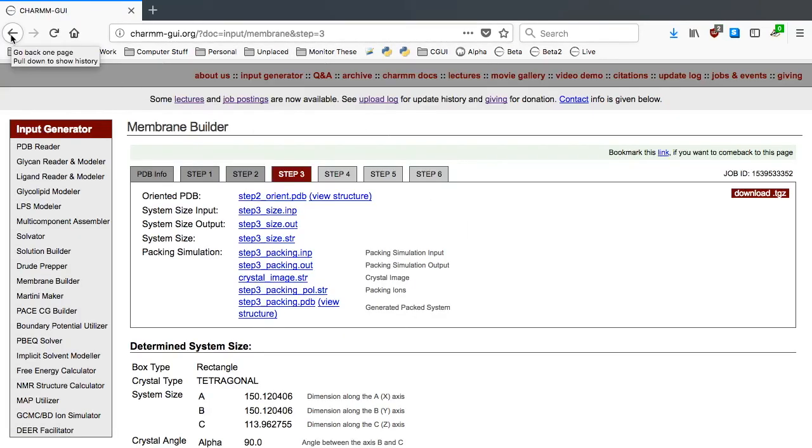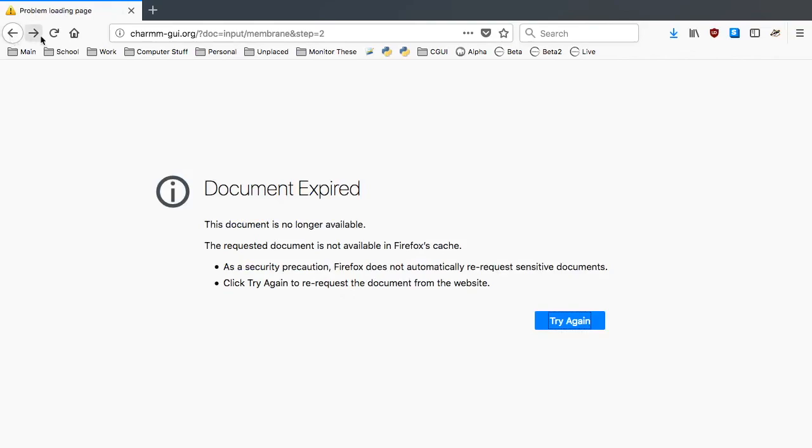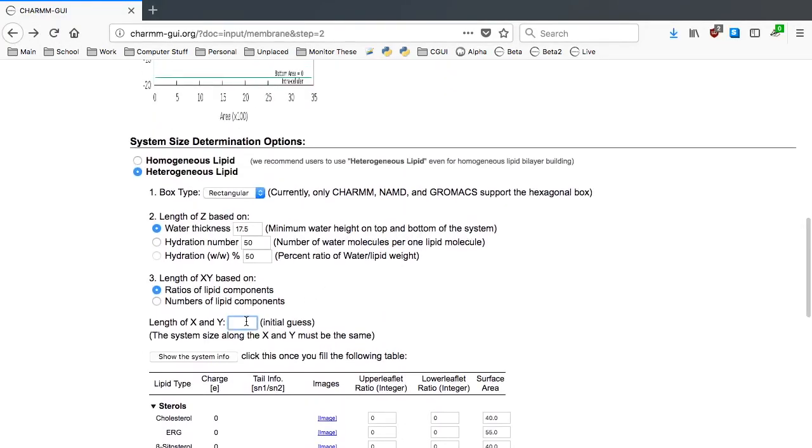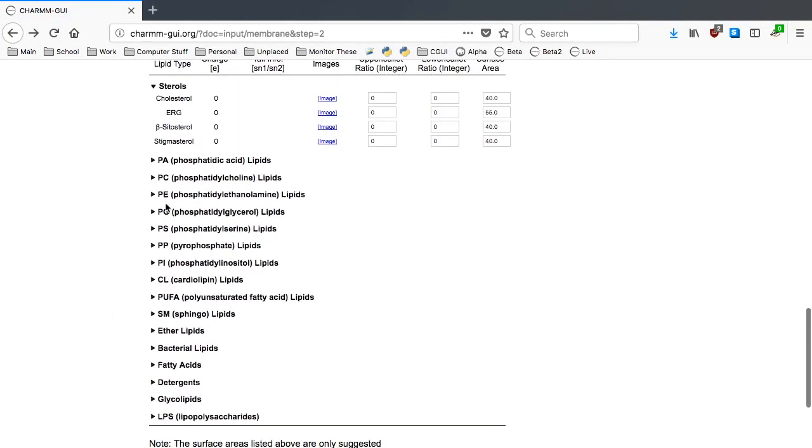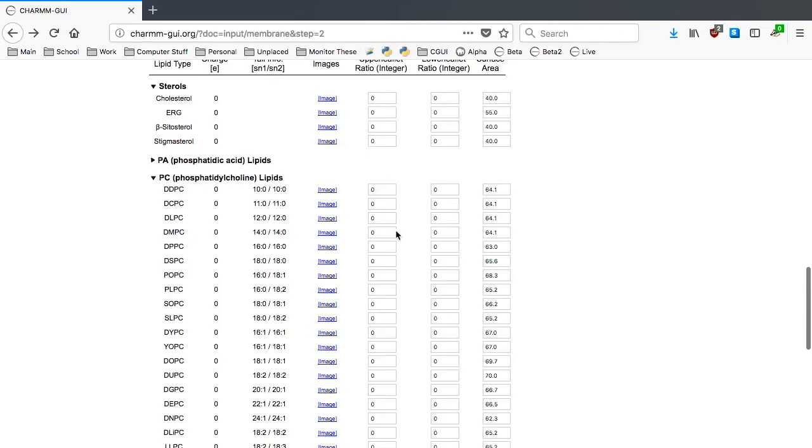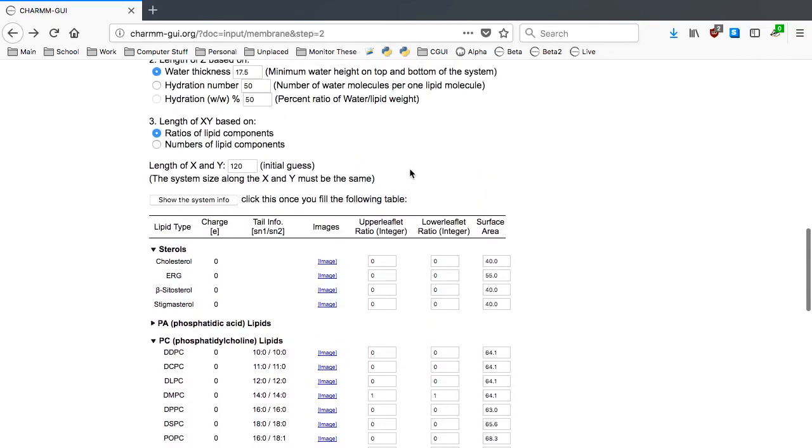If necessary, you can go back to the previous step again to adjust the XY dimension. In this example, we'll go back again and adjust it to 120.